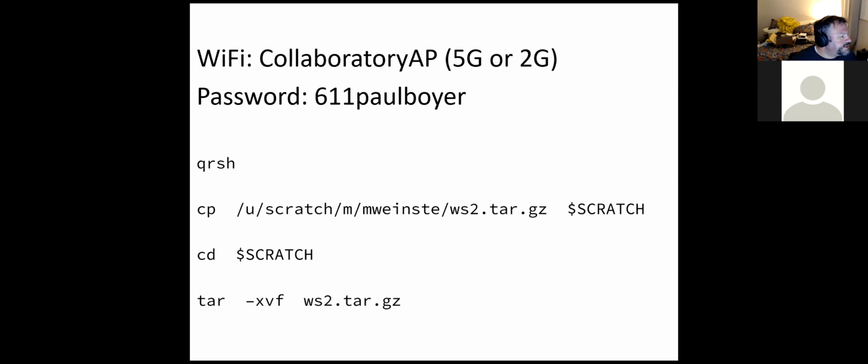Yeah, you'll probably see something that says no H data set. That's perfectly fine. That's just a default message that's telling you to set a specific amount of memory. All right. Has anybody's untar finished yet? Okay, you'll know your untar finishes when you get back your command prompt. So if you ran the tar -xvf command and you have a command prompt back, then it finished.